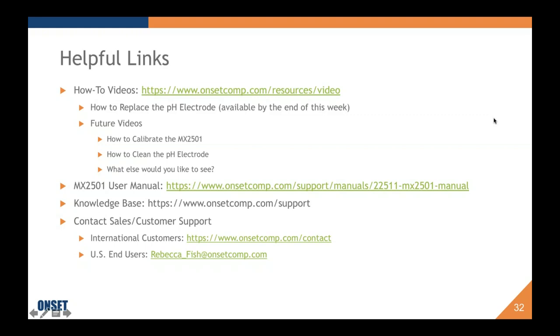Oh, dishwashing machines. I've had this question before. The logger could be fine in terms of the glass bulb of the electrode being exposed to being, quote unquote, dry for a bit, because I don't imagine that the washing machine will be left dry with it in there. The concern that I have with washing machines is that detergents are abrasive and will likely abrade the glass bulb of the electrodes. So that's something to consider, that this isn't really meant for that. I understand the application, but I don't think this logger is perfect for that. Unless you're running it through a machine without any detergent? If you're sterilizing it at a temperature below the acceptable operating temperature range, then it might be worthwhile. I'm not sure. If you want to talk more about that, definitely contact the appropriate salesperson.